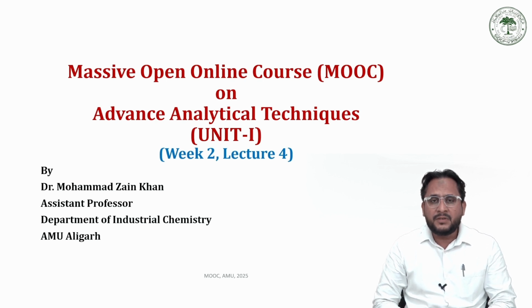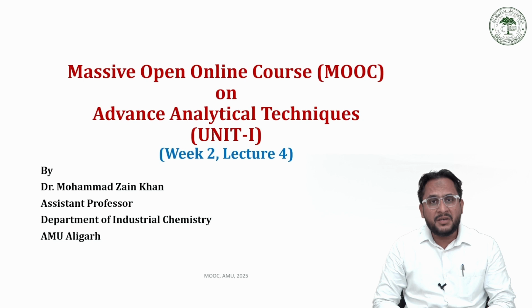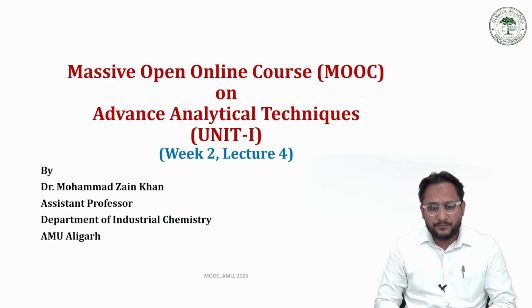Then, in the previous lecture, we started atomic emission spectroscopy, and we learned how atomic emission spectroscopy is different from atomic absorption spectroscopy, because both are based on different types of spectra. AAS is based on the absorption spectrum while AES is based on the emission spectrum. Further, in terms of instrumentation, the only main difference between these two techniques is the light source, which is required in AAS but not required in AES.